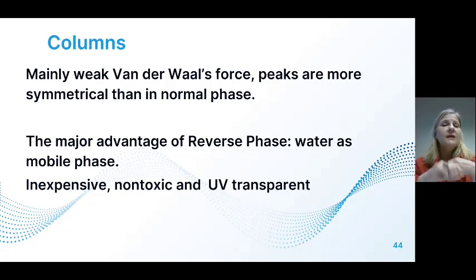And number one, it's inexpensive. Water is not expensive to prepare. And then it's non-toxic. With normal phase chromatography, you have to have special procedures to dispose of your hexane and your chloroform, while with water as a mobile phase, it is non-toxic.